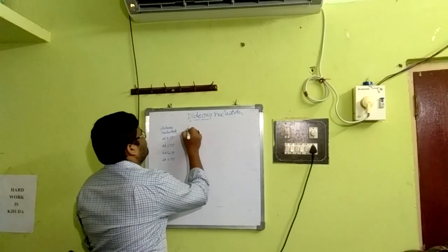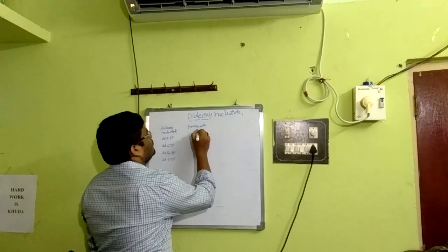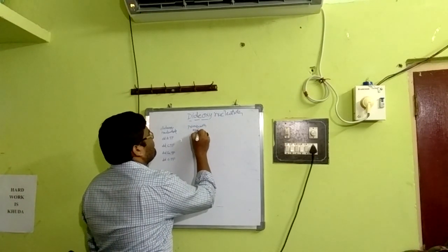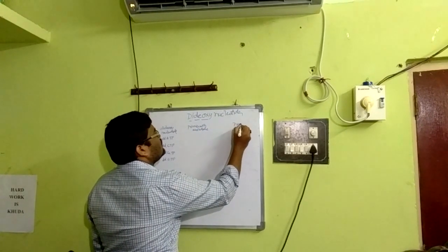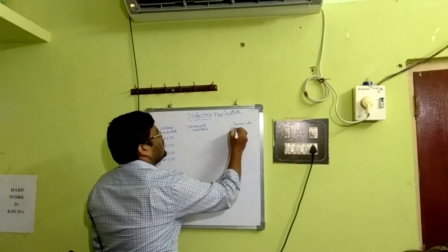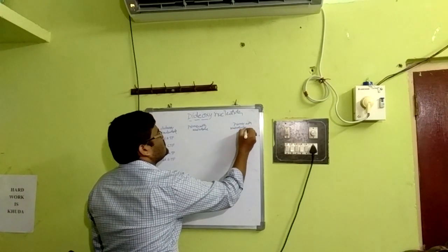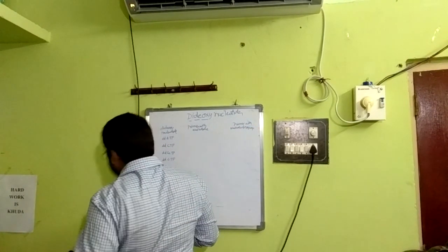Then this is primer with nucleotide sequence, and how it will come.